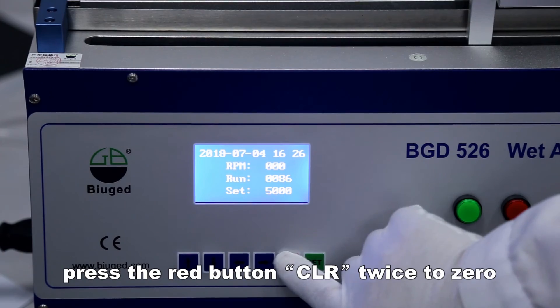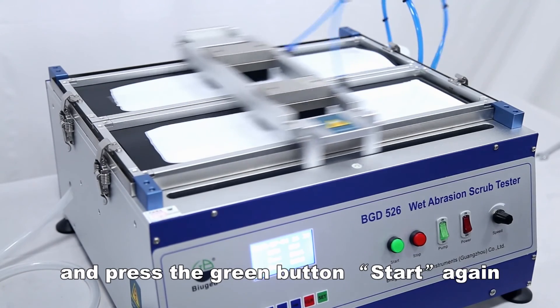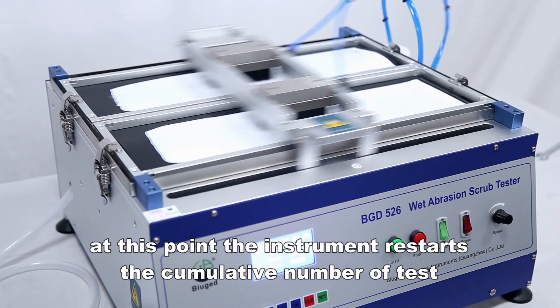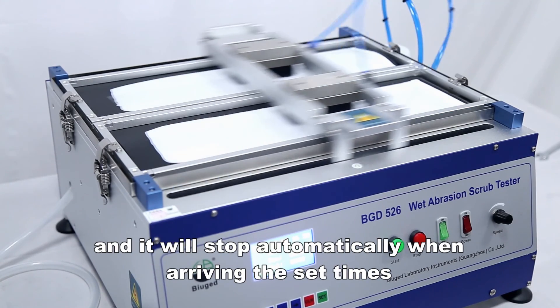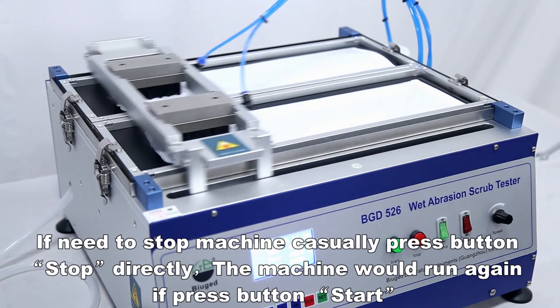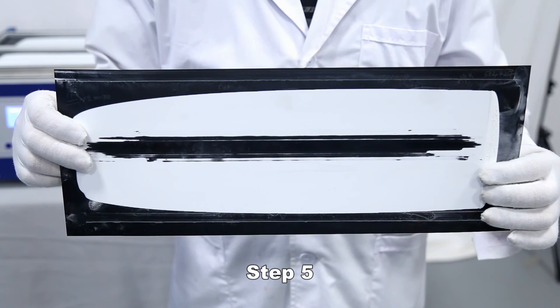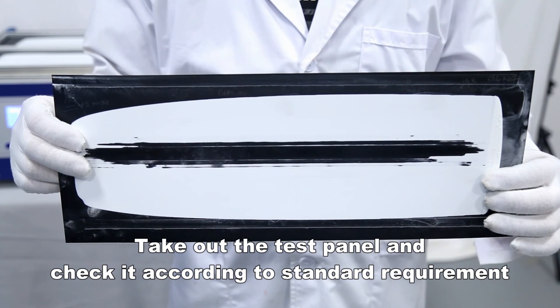Press the red button CLR twice to zero, then press the green button to start again. The instrument will restart the cumulative count of tests and stop automatically when it reaches the set number of times. If you need to stop the machine manually, press the stop button directly; press start to run again. Finally, take out the test panel and check it according to standard requirements.